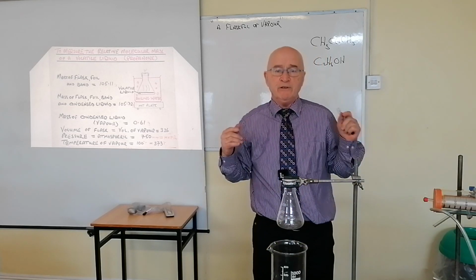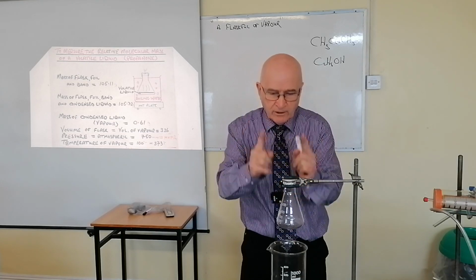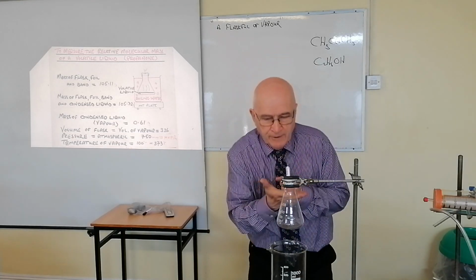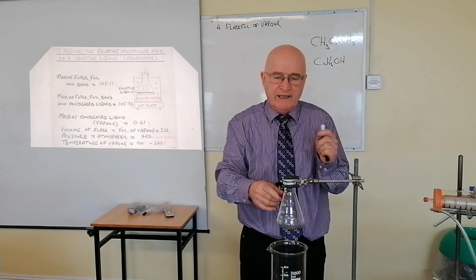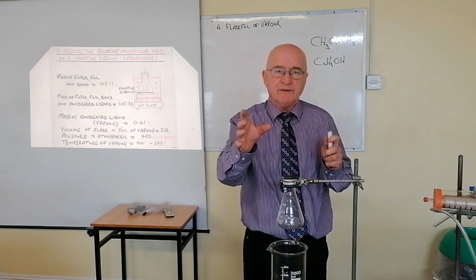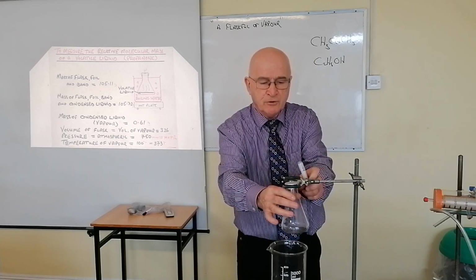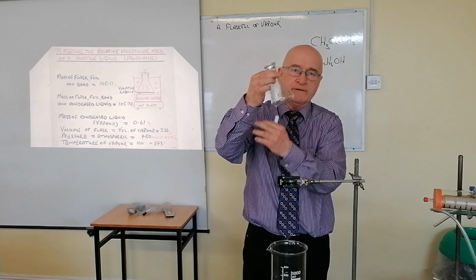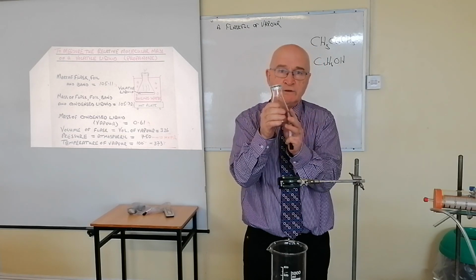Okay? And what will happen when you leave it to cool, when it's out of the boiling water? The vapor in there is going to condense and go back into liquid. So the liquid will be at the bottom of the flask. And 5-10 minutes later, you take this away and you weigh it. Now, if you're going to weigh this again, let me remind you of something, please. You must dry the outside, dry under the tin foil. There must be no water here, and it must have cooled fully.